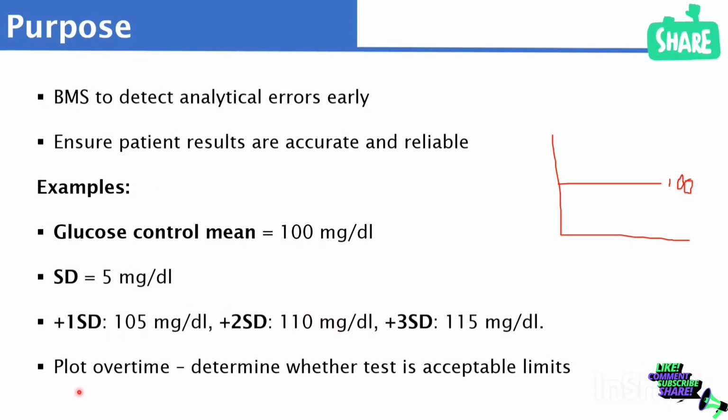So now when we plot this over time, it can help us to see whether the result we are seeing, are we supposed to accept it? Are we supposed to reject it? When we accept it, some of the accepts can be warnings. Okay, when we accept it, fair enough. When we reject it, that means there is something we must have seen, and that thing is the reason why we are rejecting it. And that rejection means that there may be need for what? Investigation.